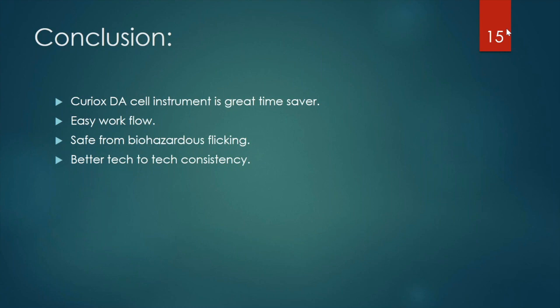So I think it's better to automate the whole system of mixing also, but you could see how much these variabilities are going to affect your results. If the washing is uniform, I think that solves half of the problems in flow cross matching.